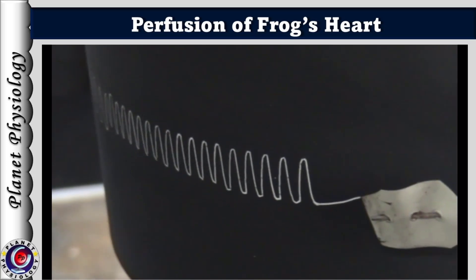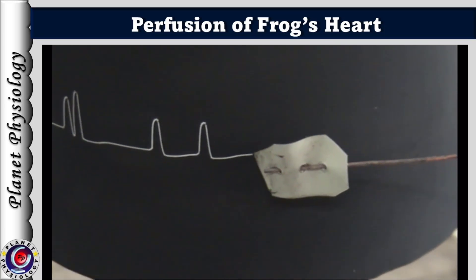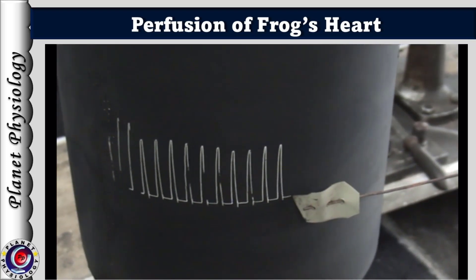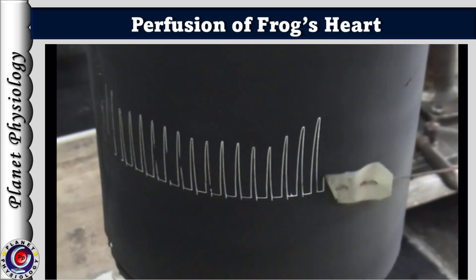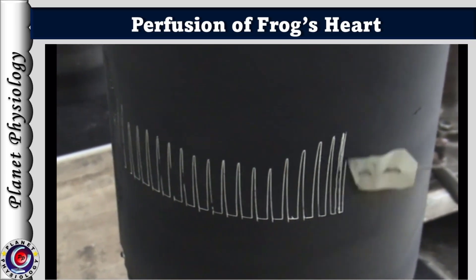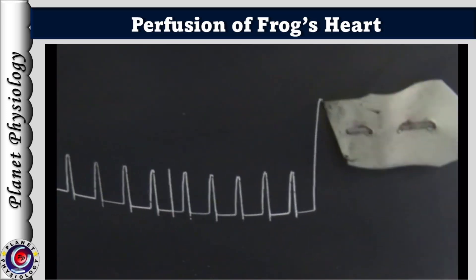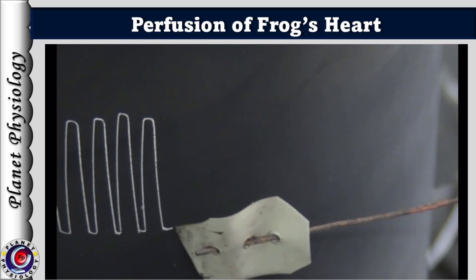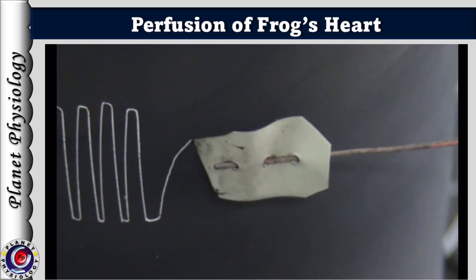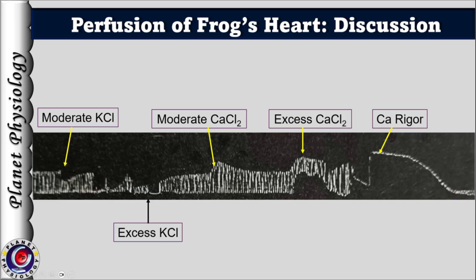As the heart is perfused with Ringer's solution, the effect of excess KCl is washed off. Once the heart regains its normal uniform activity, one drop of CaCl2 is added into the perfusing fluid. It immediately results in an increase in force of contraction, which is very obvious and evident from the graph. Adding a few more drops of CaCl2 causes the heart to stop in systole due to excess calcium. As perfusion with normal Ringer's resumes, the heart slowly recovers. Thus, all these effects are temporary.